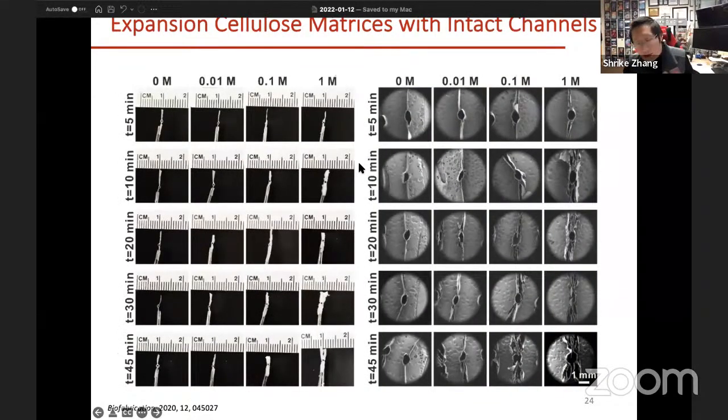But then, as mentioned, you can, depending on how much of the expansion process you subject these devices to, right? Depending on whether you subject them to different concentrations of sodium borohydride, or to the same concentration but different bubbling times, you can expand this device more and more with higher concentrations or longer times, right?